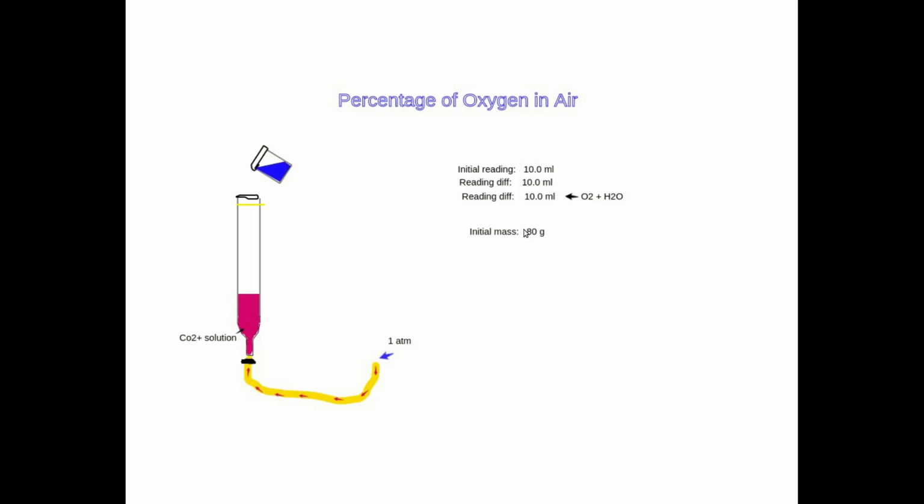Let's say it's 80 grams, and after we fill in water up to the level marked by the rubber band, we have a final mass of 40 grams.